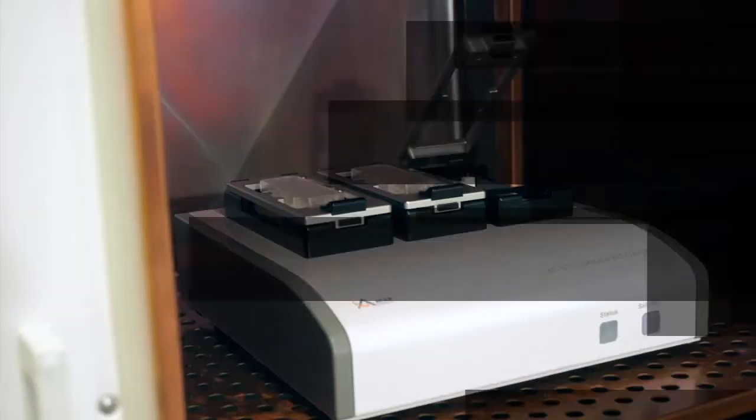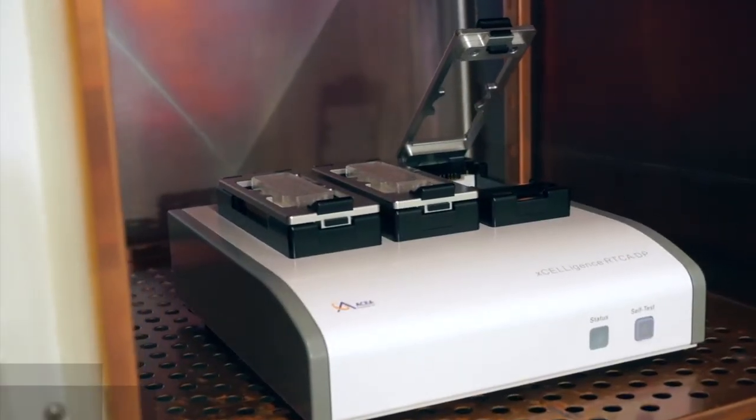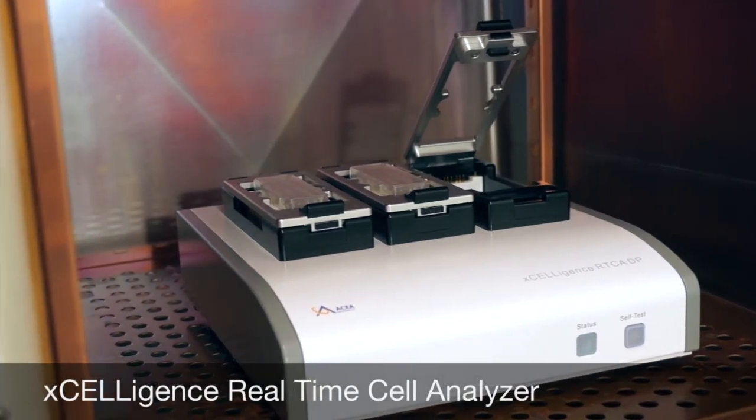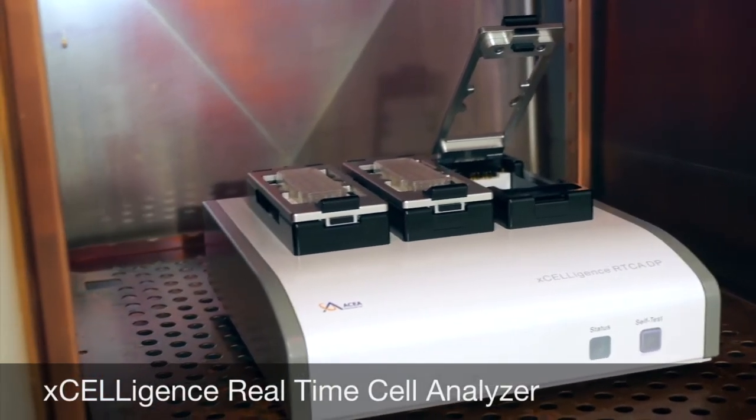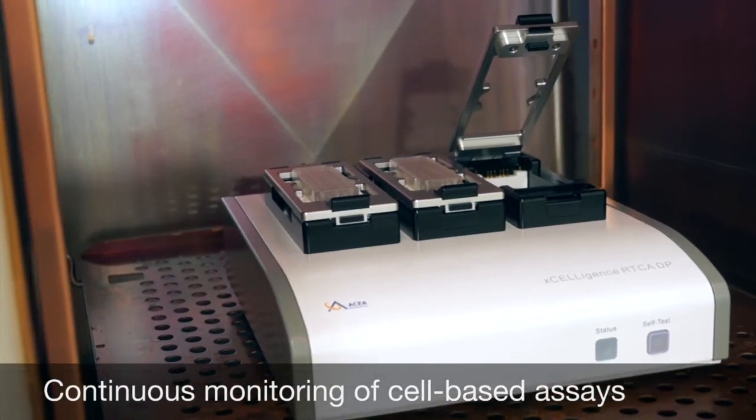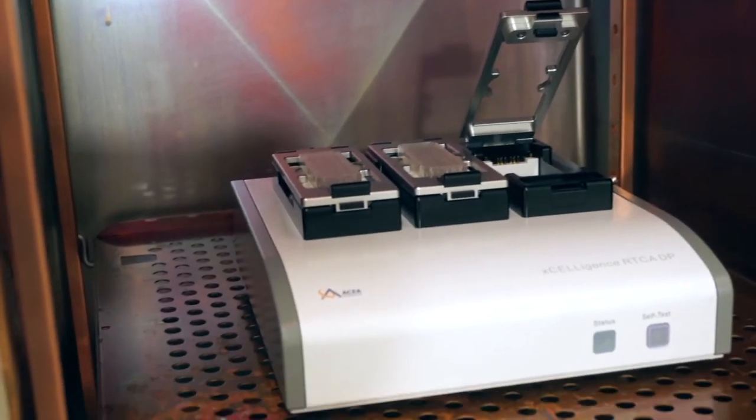The xCELLigence DP analyzer offers simplicity of method and reproducibility of results for your cell migration assays through dynamic, real-time, label-free measurement.